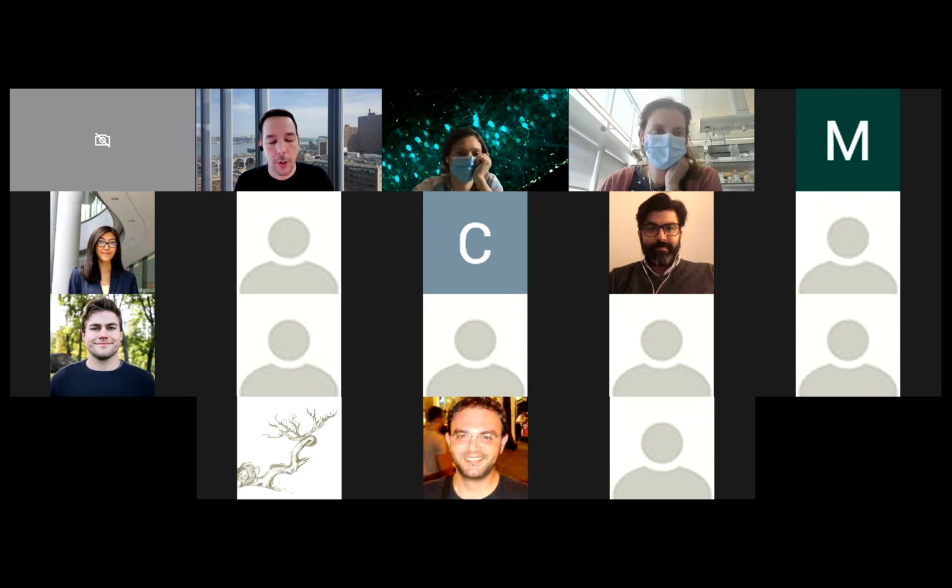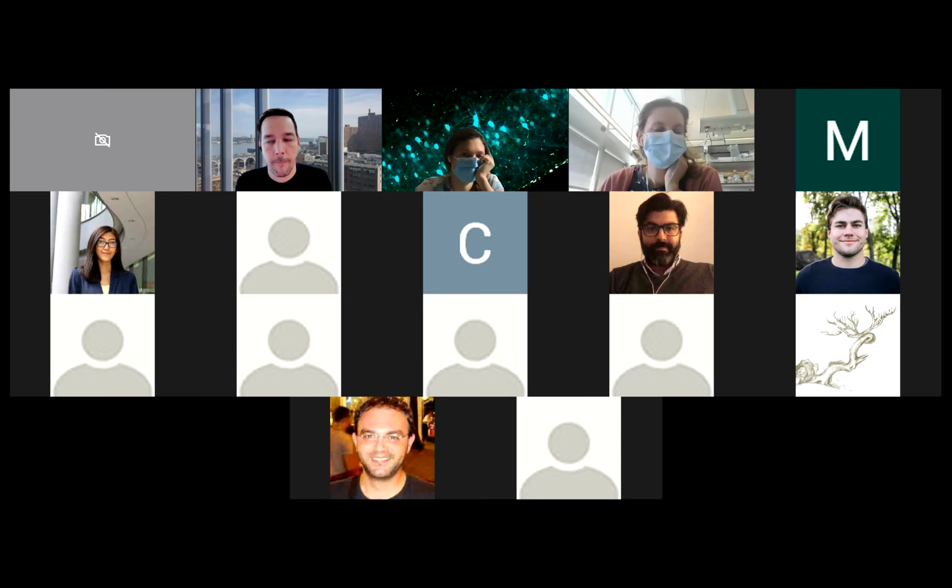These registration problems are hard if there are no landmarks to help the registration; you would think the accuracy could be quite poor. That's the case for a lot of the spinal cord. There's really just the gray matter and the white matter. There are other regions that are a little difficult to define with NeuroTrace, but we can still get good results, same with the brain. So you shouldn't have to do any manual adjustments afterwards. But it does depend on the sections being good. If the sections are really badly damaged, the pipeline is not so useful.